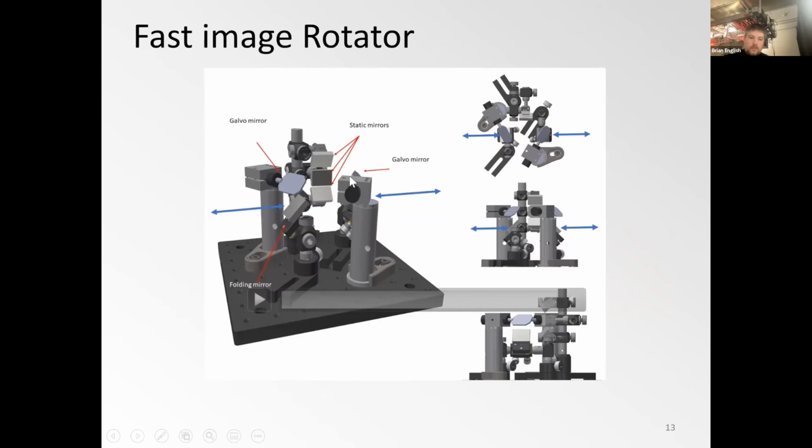So ultimately with the optical étendue, there is a little wiggle room, but you only effectively gain field of view with larger paddles.